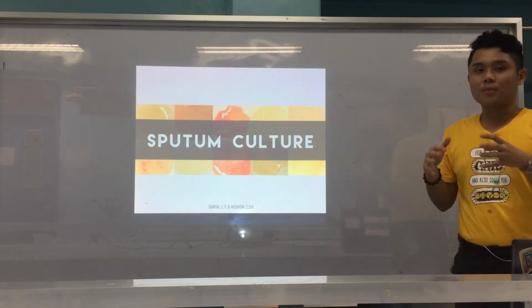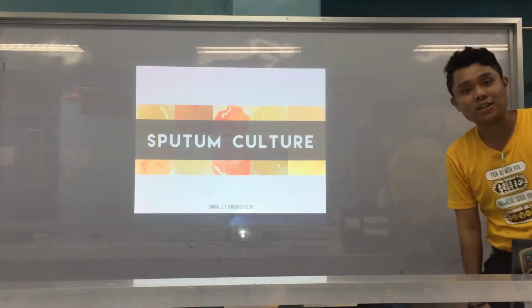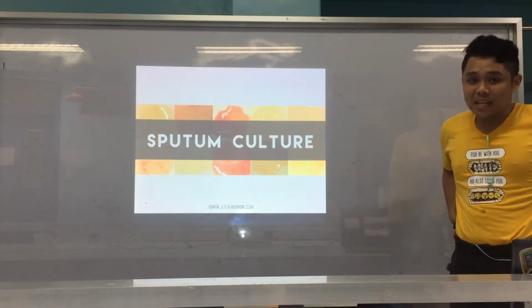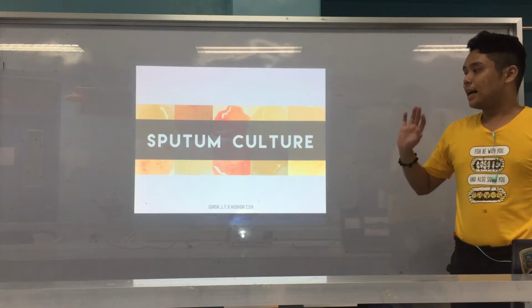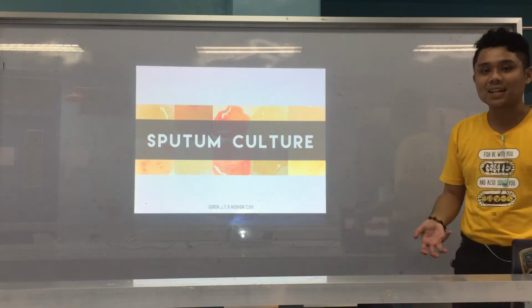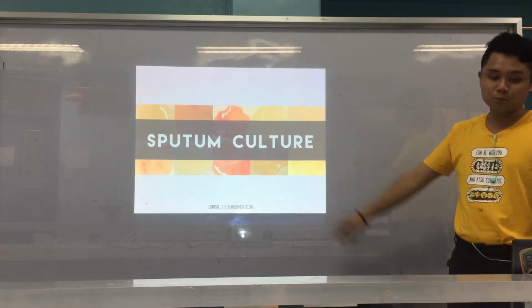We're still continuing with our lectures on the different specimen collection, handling, and processing for your different specimens. For this lecture, what we're going to discuss is sputum culture. So how do we culture sputum? Again, this is for sputum culture.